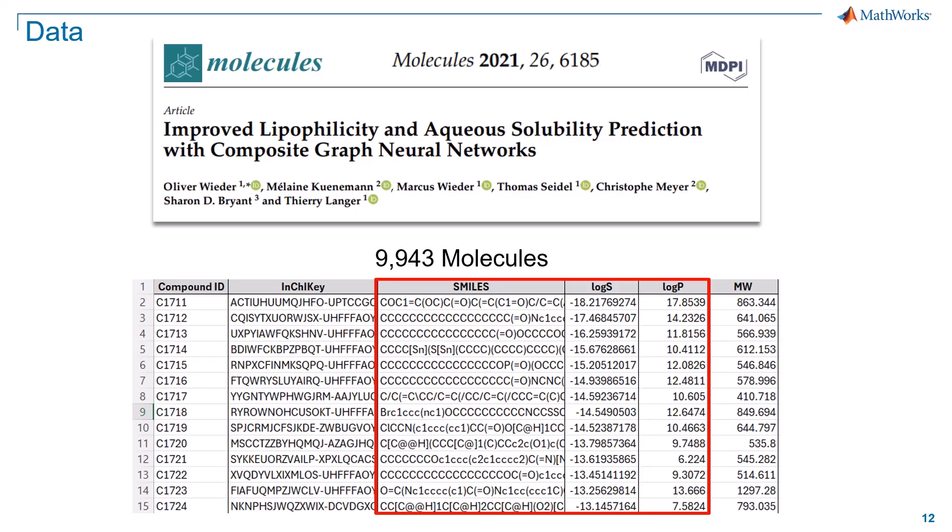This database contains 9,943 molecules along with their corresponding water solubility and lipophilicity values. These parameters are crucial in molecular design and drug discovery, as they significantly impact the compound's pharmacokinetics and bioavailability. By understanding and optimizing these properties, one can enhance the drug's therapeutic functions through improved absorption, distribution, and interaction with biological targets.